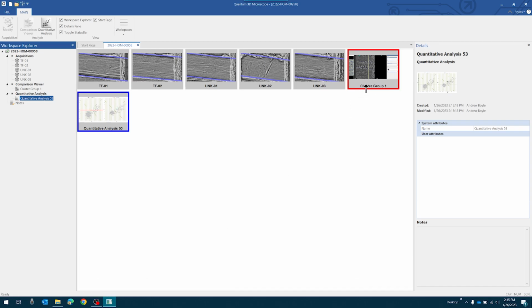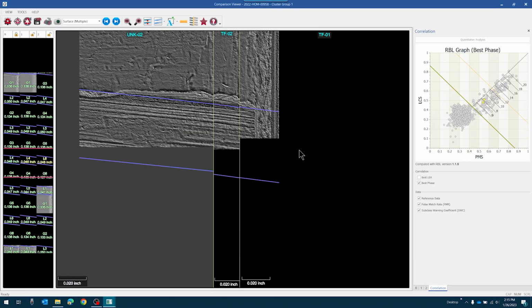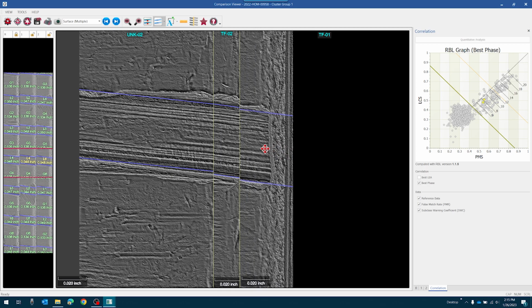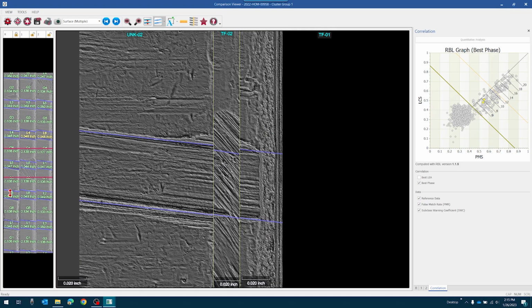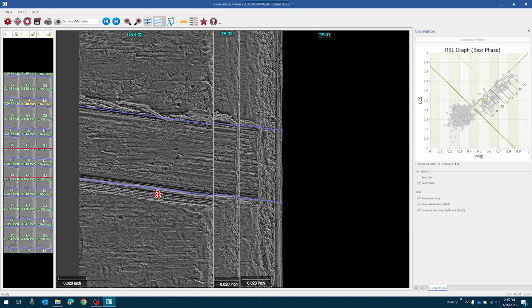And I can actually go back. If I double click on this, it will take me right back to that set. And that's not just a saved image. I have live control now. From that saved start point, I can continue my comparison work throughout the circumference of this phase set.